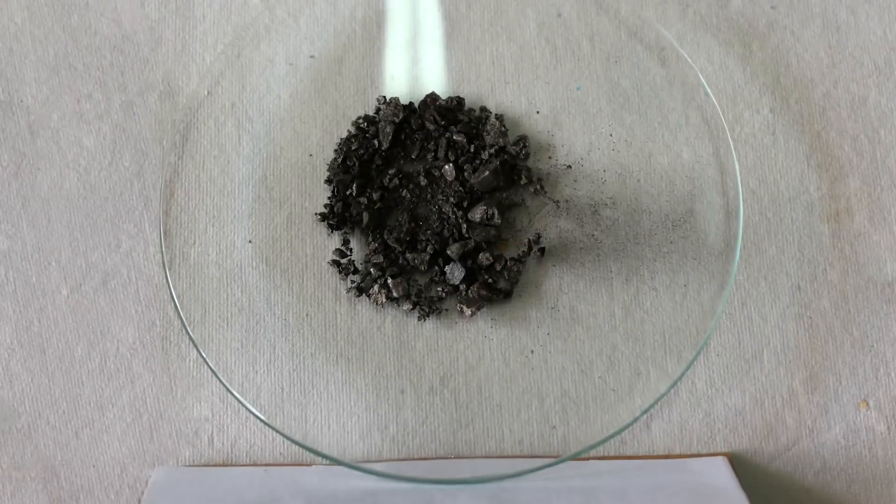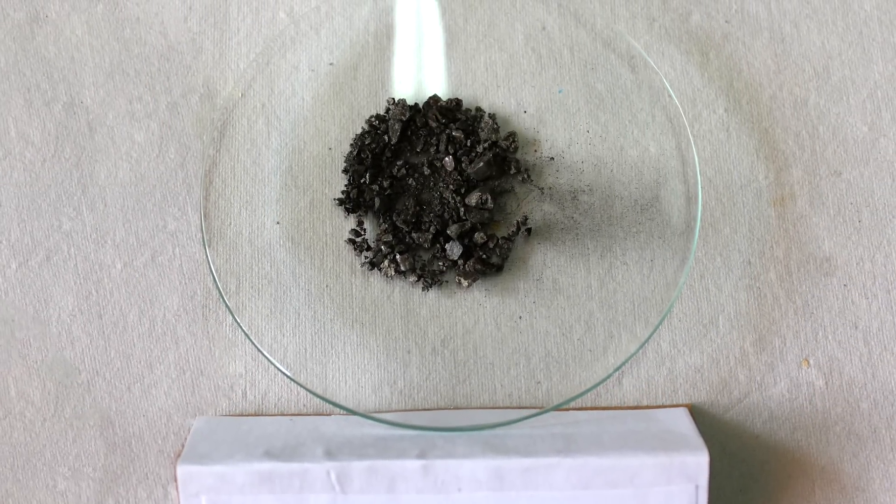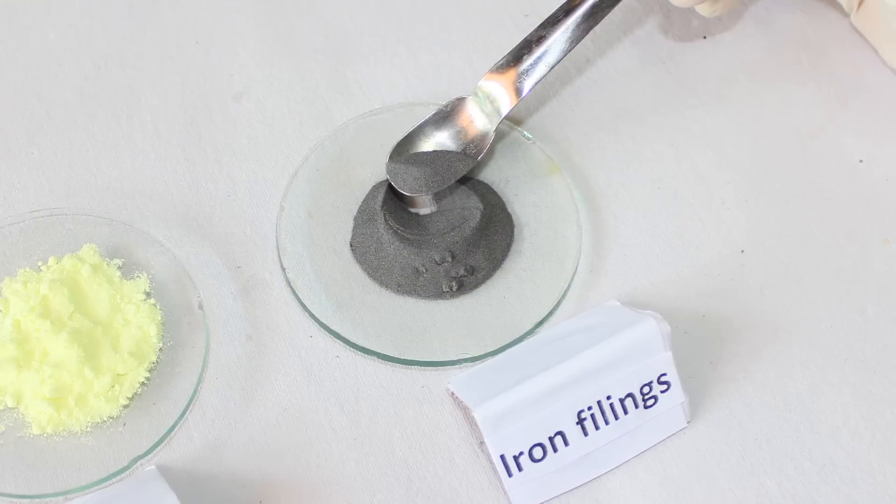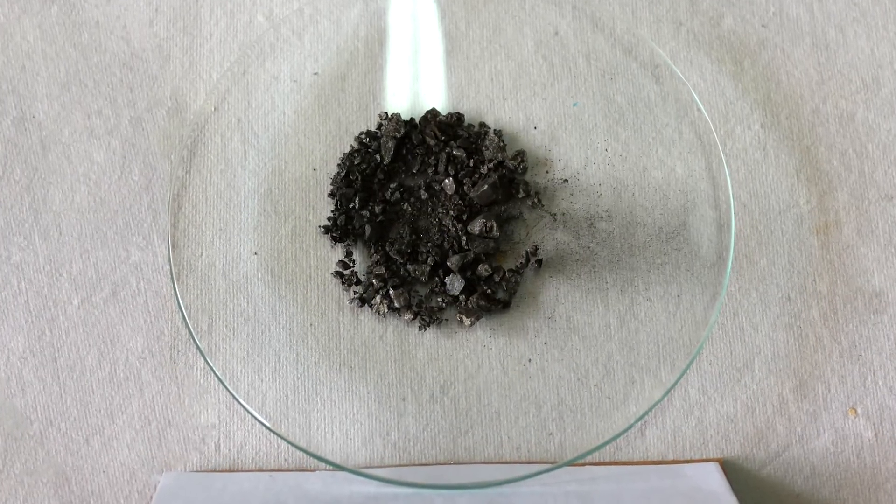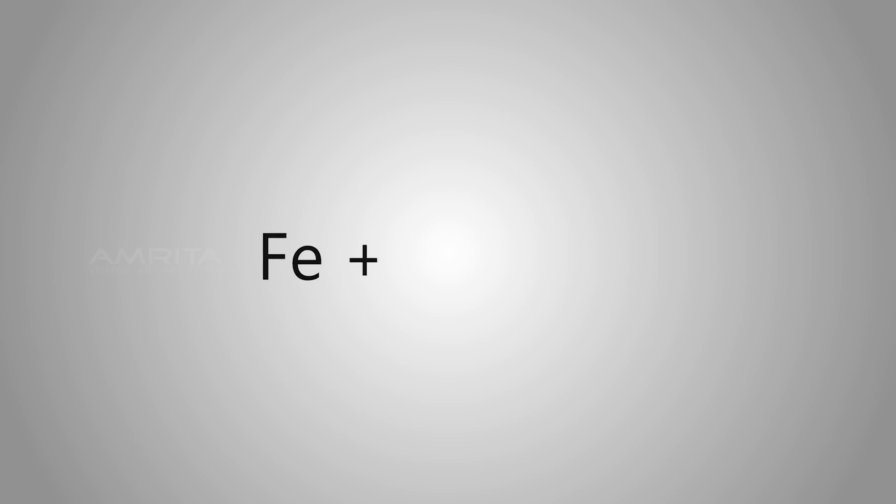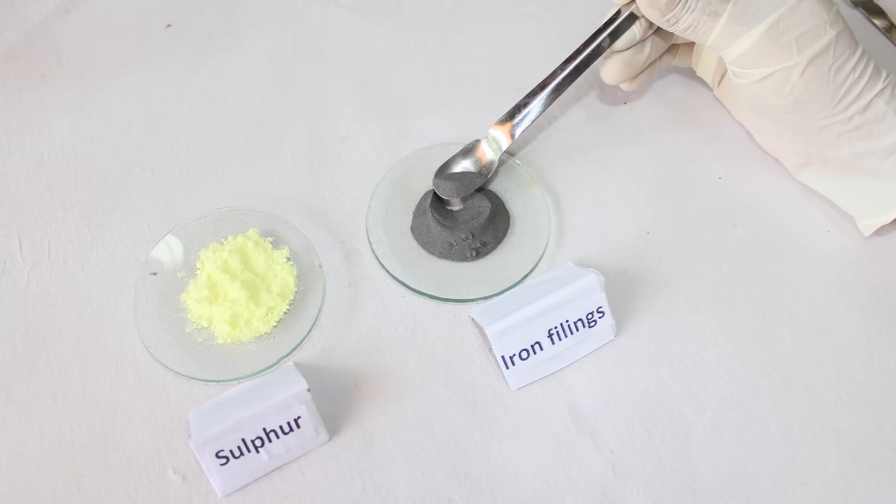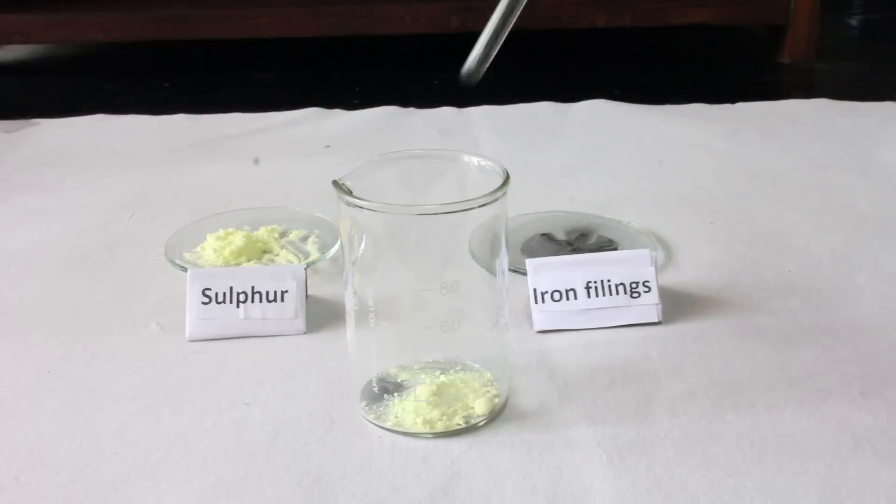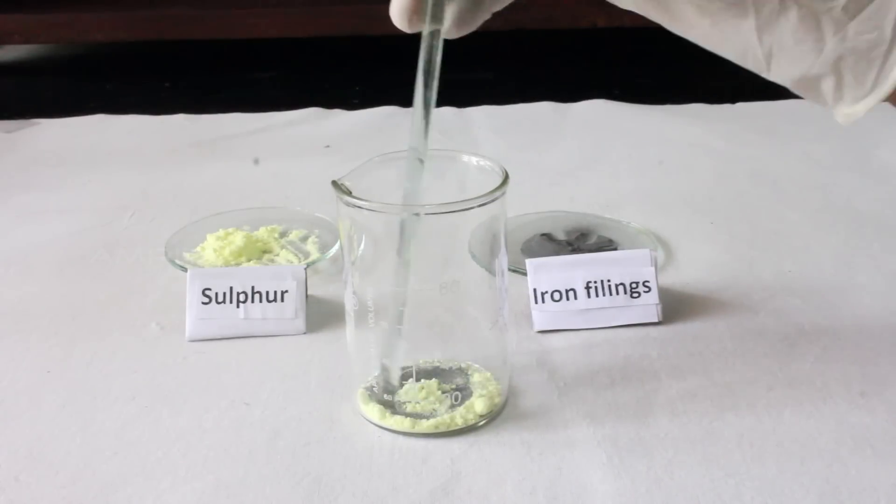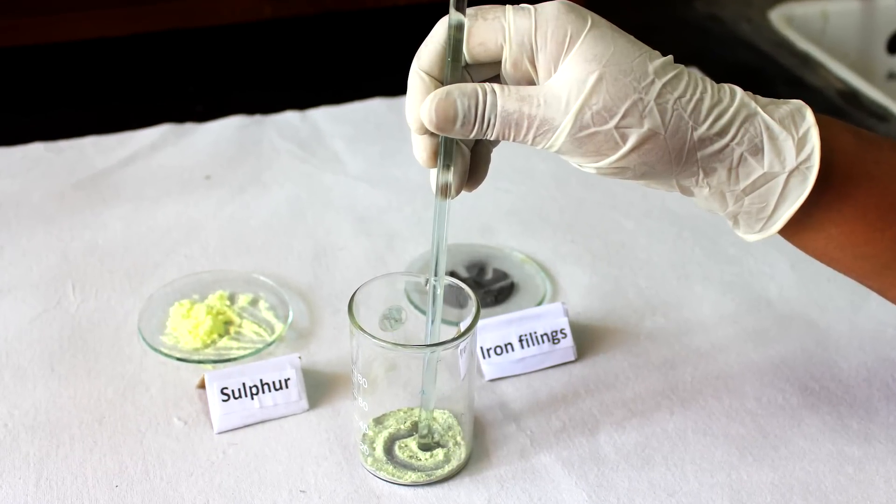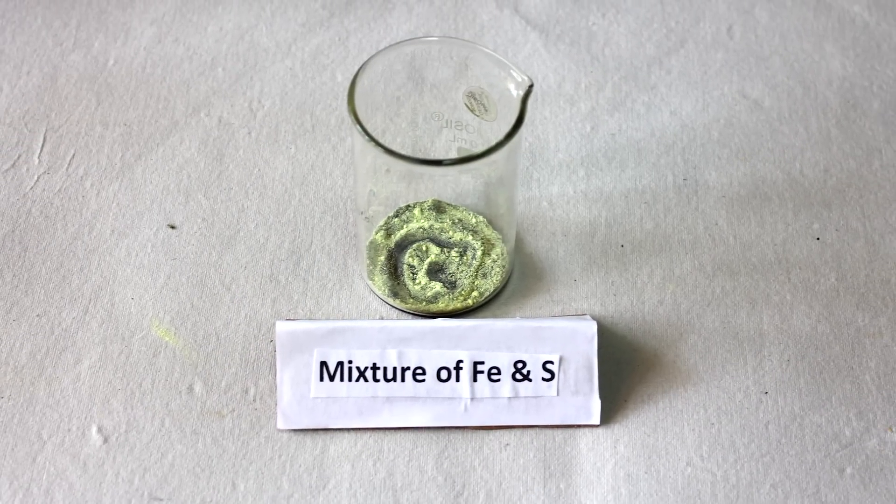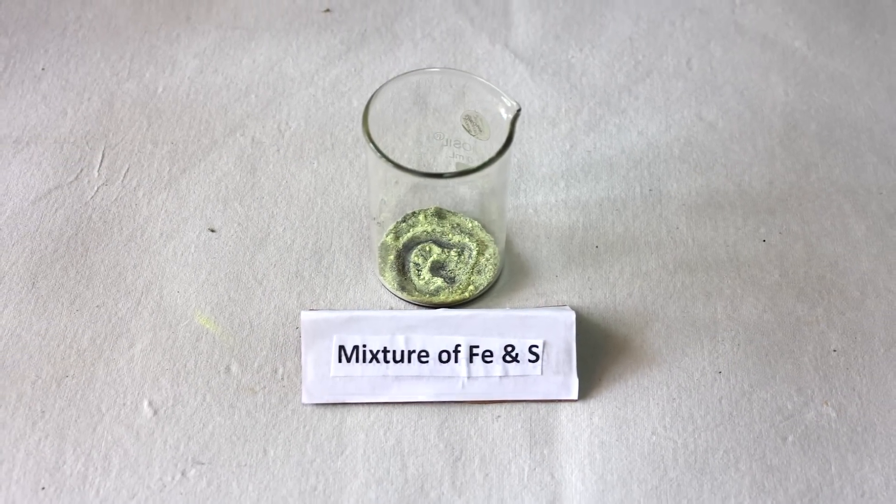Procedure. Here we take ferrous sulphide, which is a compound of iron and sulphur to do the experiment. Upon strong heating, iron is combined with sulphur to form ferrous sulphide. Now, take a mixture of iron and sulphur in a beaker and mix the contents in it using a glass rod. After mixing, we can see the yellow coloured sulphur powder and iron filing separately.